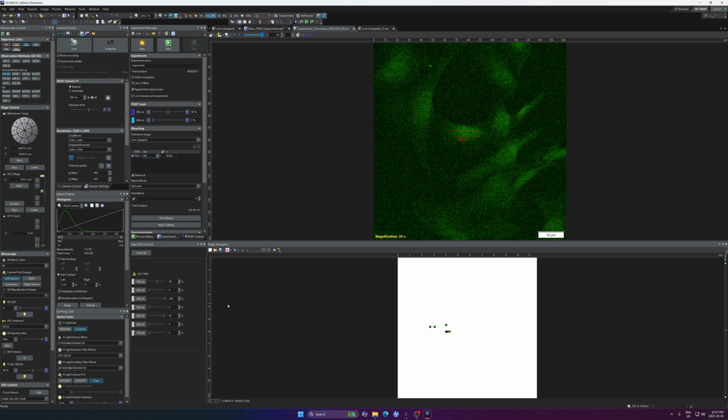And one thing is that the FRAP module basically has a 70-30 beam splitter. What that does is cut out almost 30% of the light from your camera. So that reduces your camera performance as well as your photobleaching, your imaging quite considerably.